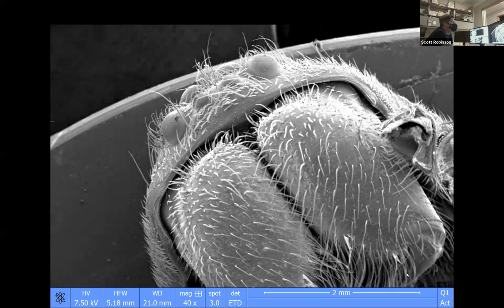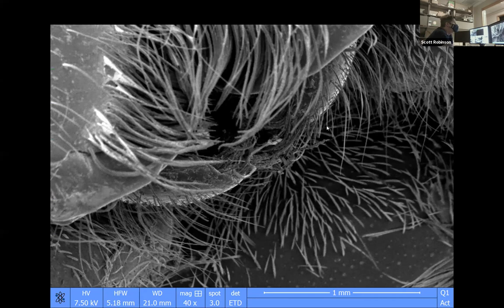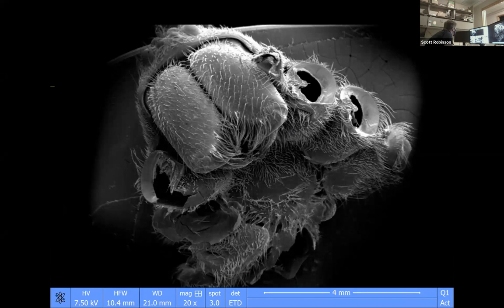They're covered with setae, but the fangs are these curved things. And if we could see them up close, we would actually be able to see poison pores, but there's just too much hair in the way. Even though you can see this is really bad, I pulled off all the spider's legs so we would be able to see its face, and we still can't see its face very well. So I'm sorry about that.